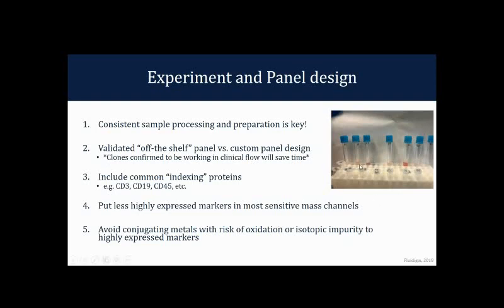These are cord blood samples, and when you're looking for small differences in heterogeneous human populations, you hope that even the color of your samples would be the same when you go into staining and things like that. Obviously, color is by no means a metric for sample quality, but I think it just goes to show that these samples were clearly processed differently in some way.